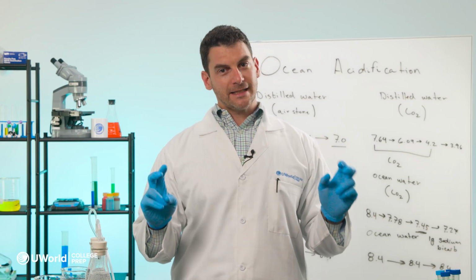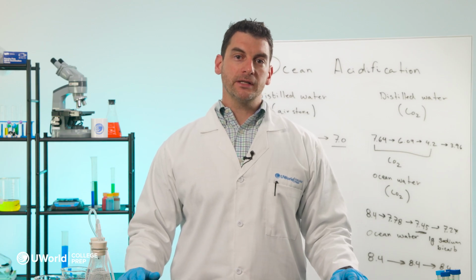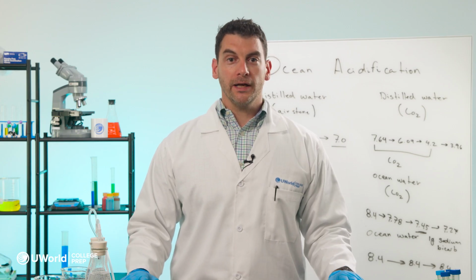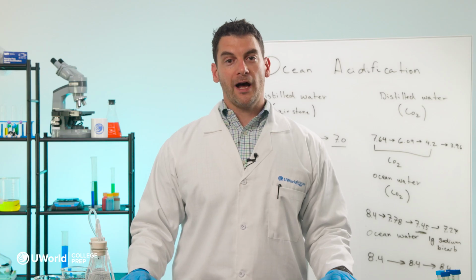This experiment reveals a crucial point. While we often focus on ocean acidification, we can see that all bodies of water, regardless of salt or fresh, can be affected by increased atmospheric carbon dioxide. It's also important to remember that while pH of oceans is decreasing, it's not predicted to become acidic for a while. That being said, the ocean is particularly vulnerable because of all the organisms, such as coral and clams, that live in the ocean and that rely on carbonate to survive.